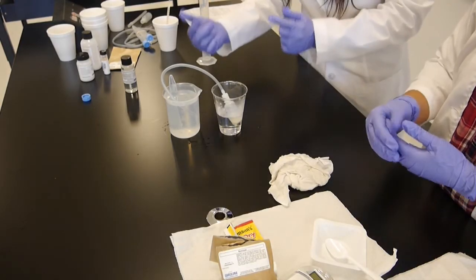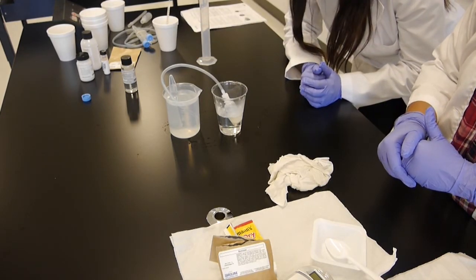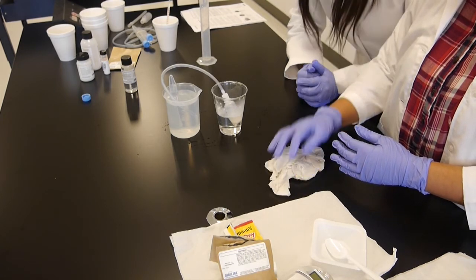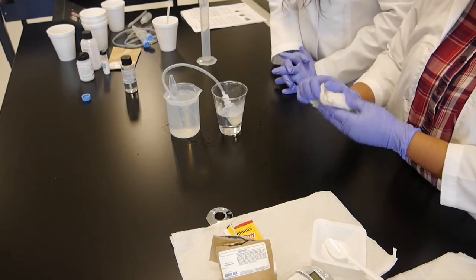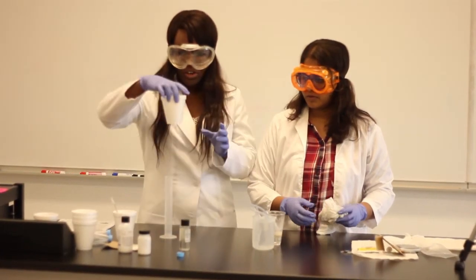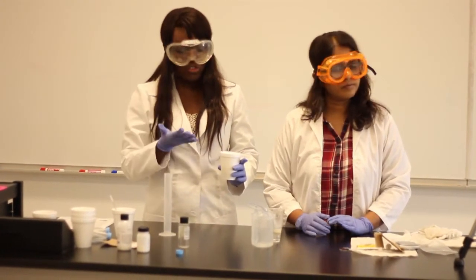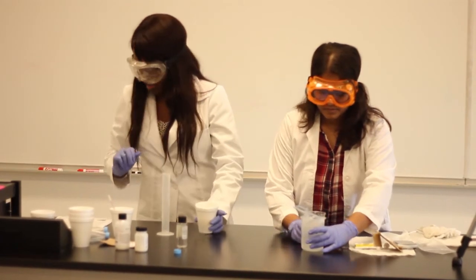So you're supposed to take a reading of the volume every 15 minutes for 60 minutes. Yes. And this is the end of the setup. And so this is the setup. So you have enough yeast here to actually do a total of 5 experiments. And they want you to have 6 runs, but you're using the sucrose twice, right?